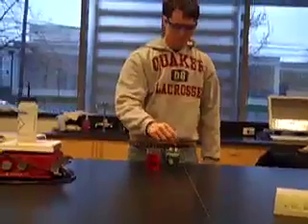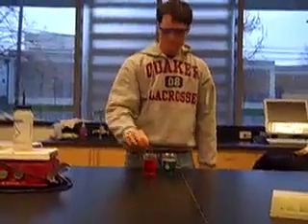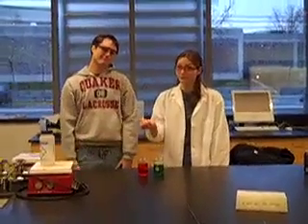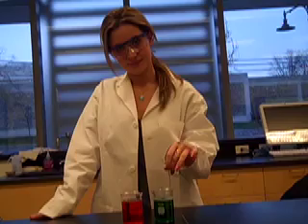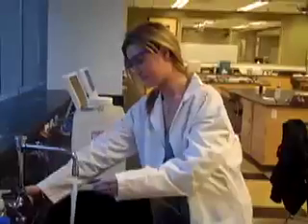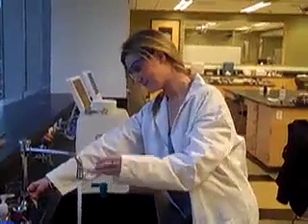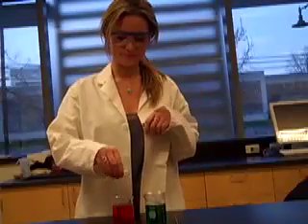Our second lesson today is about lab contamination. Let's observe as two students attempt to mix two different substances in the lab. Notice how Nick did not rinse the stirring rod between mixtures. Now watch as Carolyn, a gifted chemistry student, mixes the first solution, rinses the stirring rod, and then mixes the second solution. Much better.